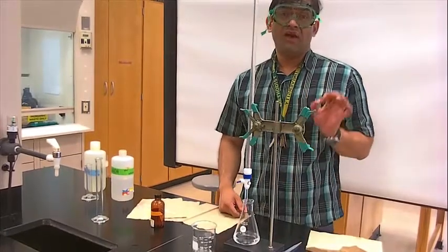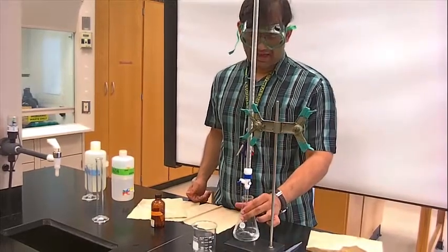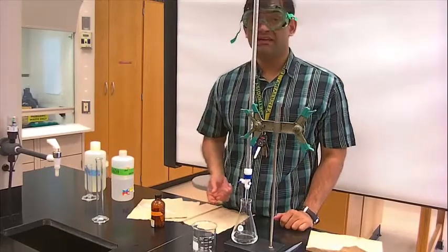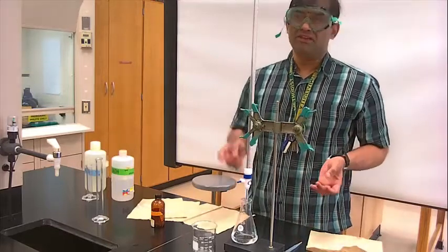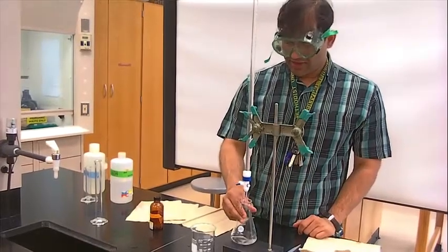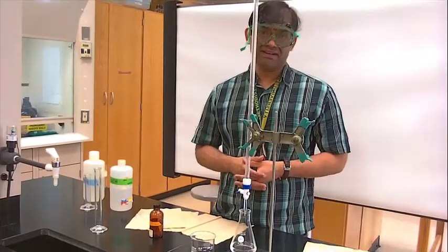So we're going to add 1 mil at a time. How do we know when we're done? We know we're done when we have a pink solution. That is where the indicator comes in, the 2 drops of indicator that you've added. Now, if you have something that's too pink, you've overshot. So every now and then you want to stir this to make sure that the pink is very light, but it still has that pink tinge.